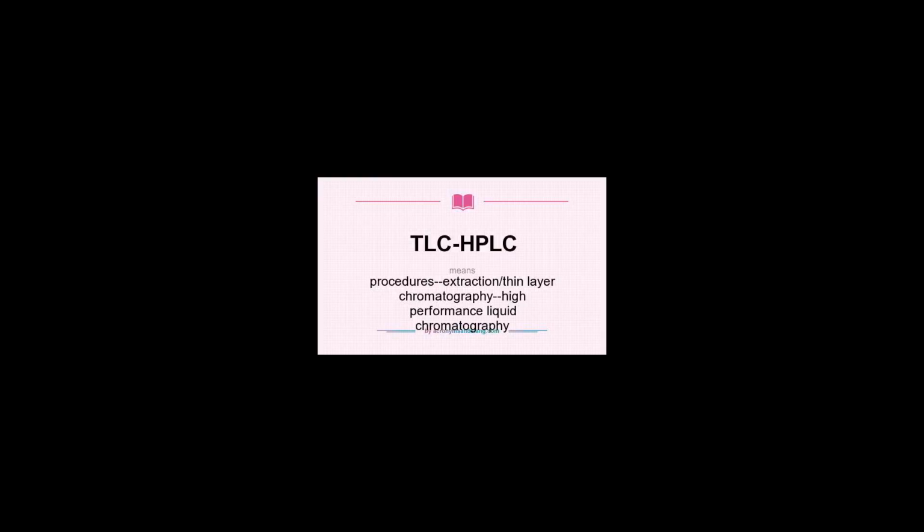Water, 7.3 times 10⁻⁶ J per square centimeter. Methanol, 2.2 times 10⁻⁶ J per square centimeter. And to the hydrophobic surface of the analyte and the ligand respectively. The retention can be decreased by adding a less polar solvent, methanol or acetonitrile, into the mobile phase to reduce the surface tension of water. Gradient elution uses this effect by automatically reducing the polarity and the surface tension of the aqueous mobile phase during the course of the analysis.